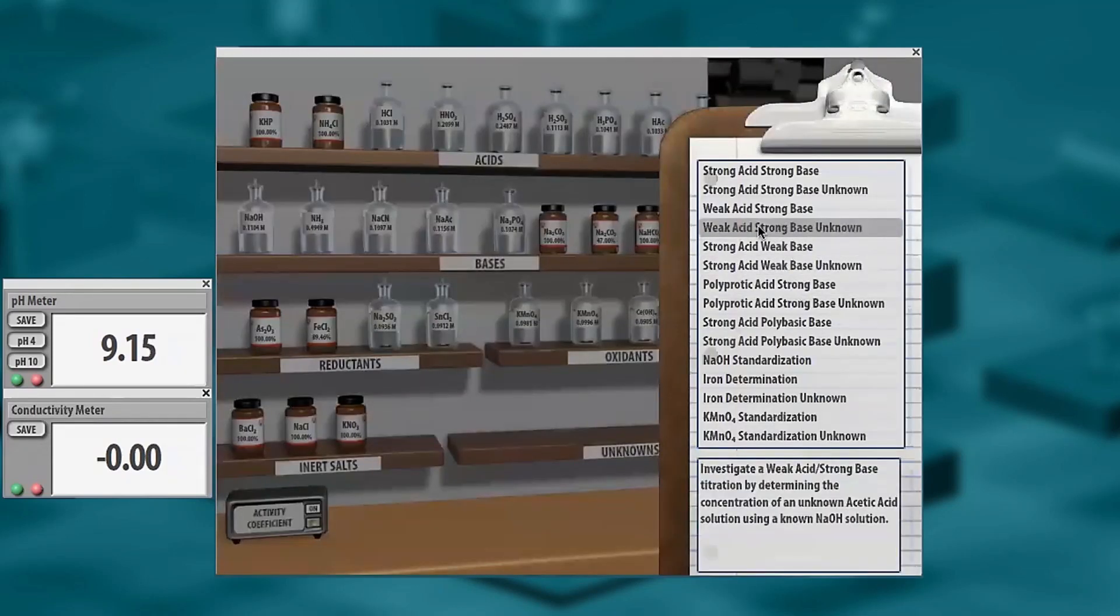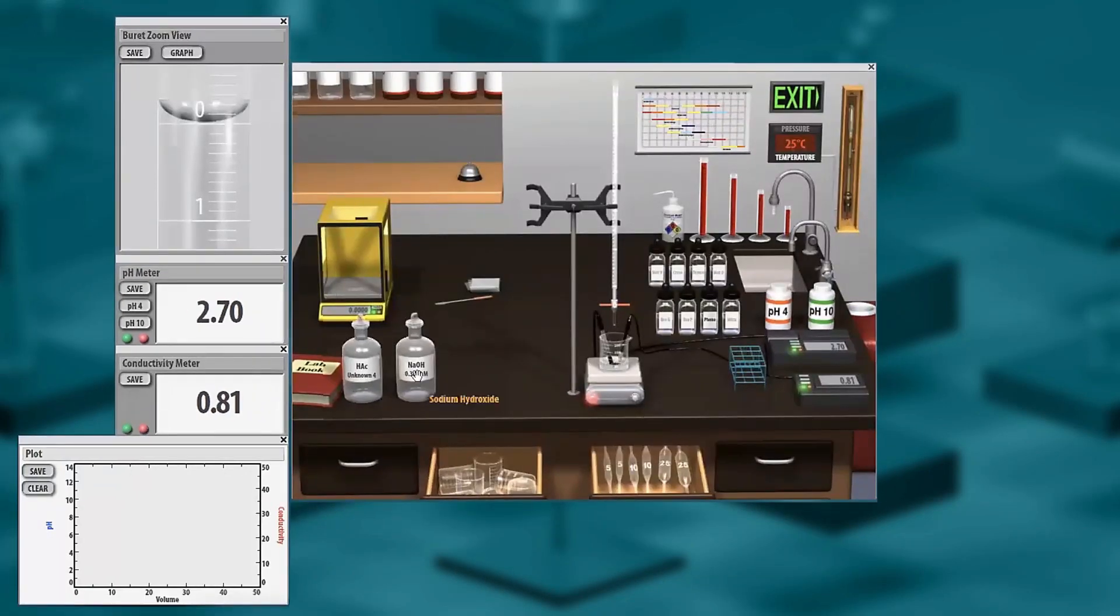You can do presets. So here's a preset: weak acid, strong base titration. Go and do it. Save this data to the lab book.